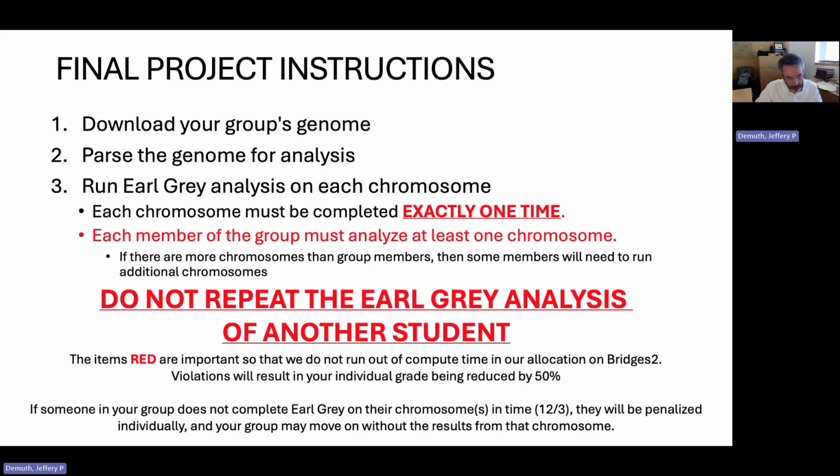So transposable element annotation is really computationally intensive. And so we are probably going to burn through 100,000 compute hours all total. Now, that might sound scary, but because we're running 128 cores at a time, everything you do is multiplied by 128. And I expect that most of you, since we've broken it down into individual chromosomes for analysis, it's probably going to run in an hour. And some of the really long chromosomes, when you get into 100, 200 megabase chromosomes, those might take 5, 6, maybe 10 hours to run.